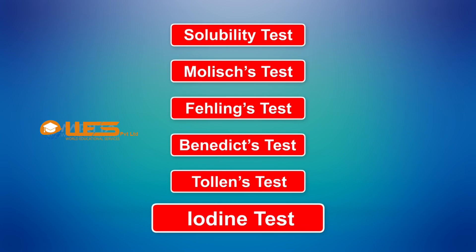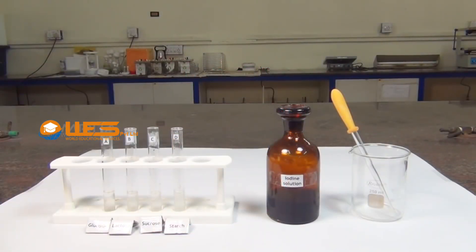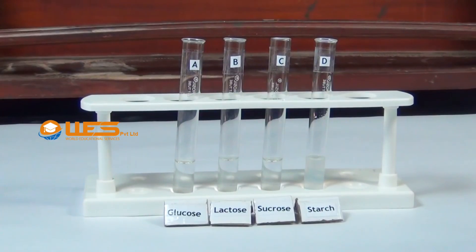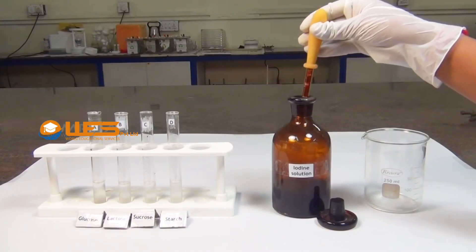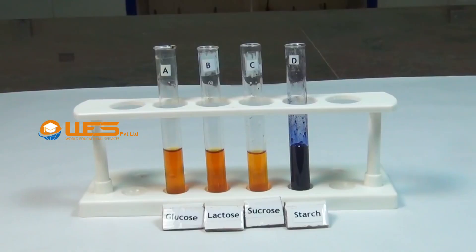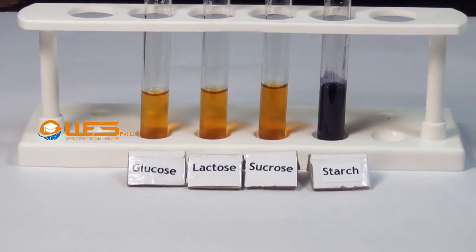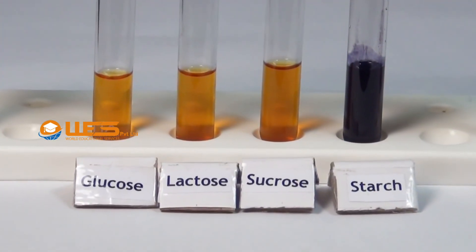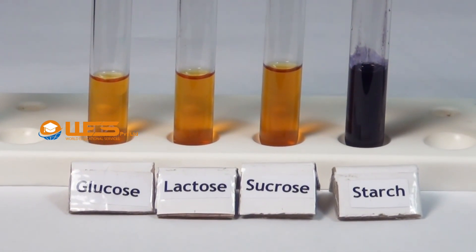Iodine Test. Take a small quantity of aqueous solutions of glucose, lactose, sucrose and suspension of starch in four test tubes A, B, C and D respectively. Using a dropper, add a few drops of iodine solution into each test tube. Iodine reacts with starch to form a blue-coloured starch-iodine complex, whereas no such complex is formed by the other samples.